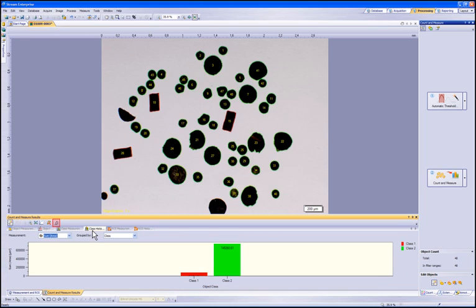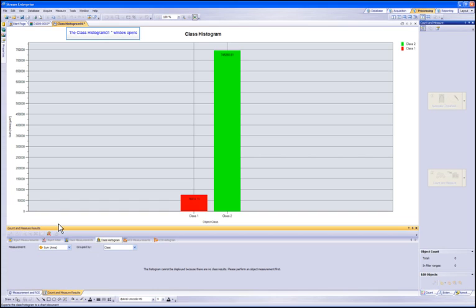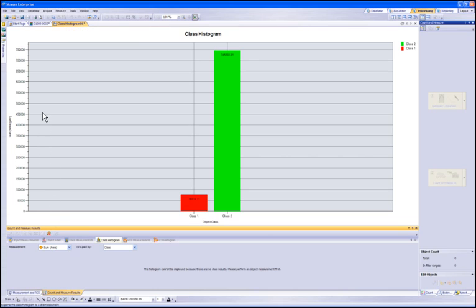The next window will show a histogram of the classes. This histogram can be exported to a graph to be used in the reporting tool as well by clicking on the Export to Chart button. Let's go ahead and export this chart. The class histogram is now opened as a chart.